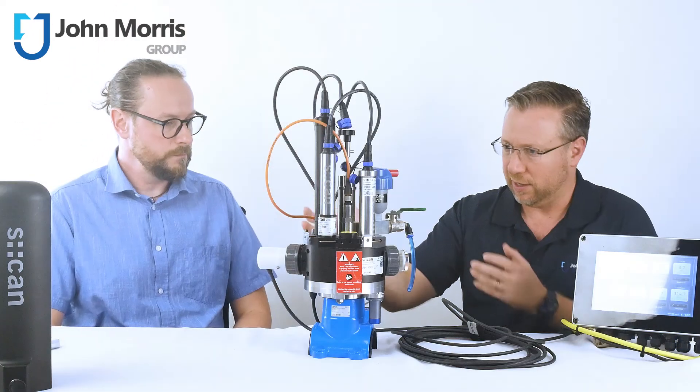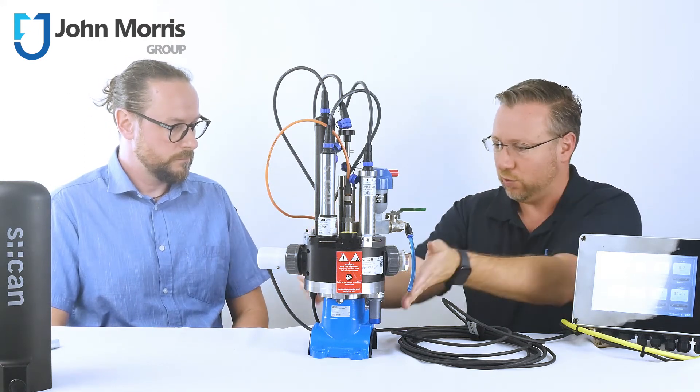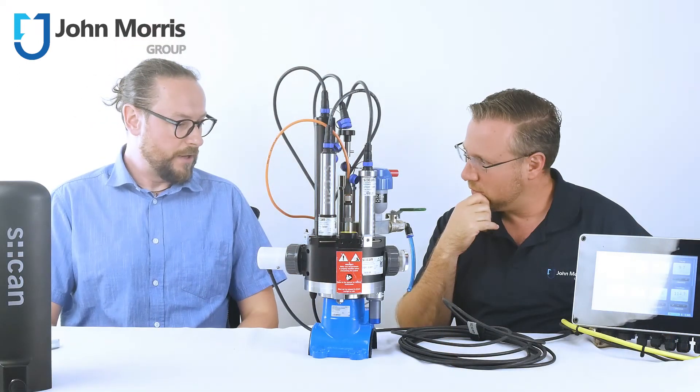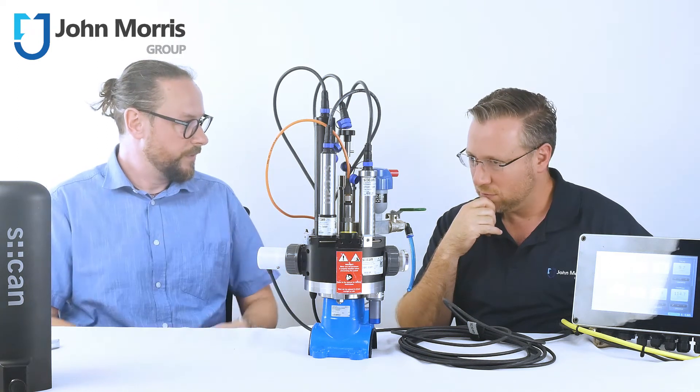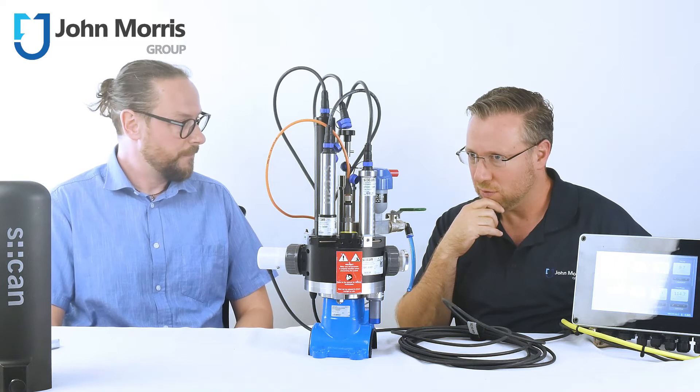Right. Okay. Let's say I want to have a couple of these located around but I just want to have the saddle clamps. Can I remove all of this off the top and then just move it from site to site? Sure. So if you have only this unit, then you can leave the saddle clamp on the pipe. You make it some kind of blind and then you can remove the measuring unit to another clamp saddle and fix it there.